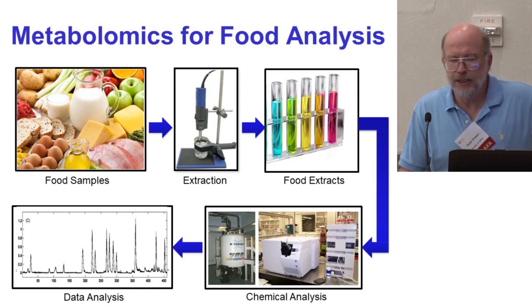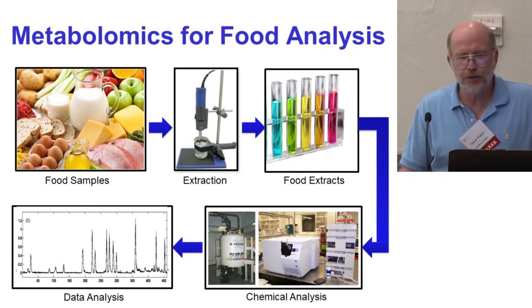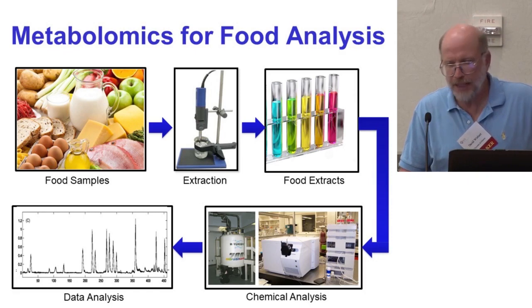If it isn't, then you'll just simply take the fluid. The extracts are a little more complex because there are different components for fatty tissues versus muscle tissues versus plant tissues and roots and leaves as you might analyze. But the same chemical analysis is performed, and in many respects, the same data analyses are performed.